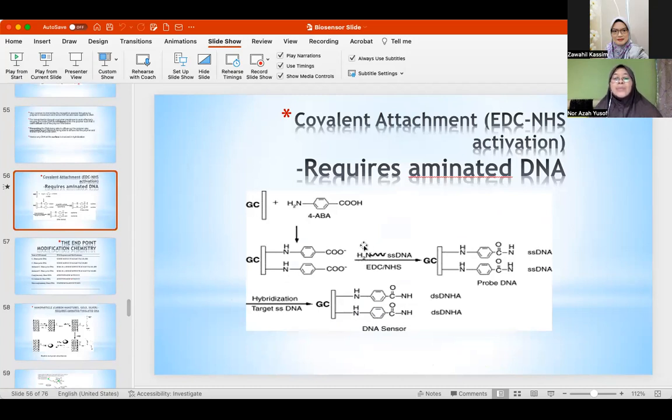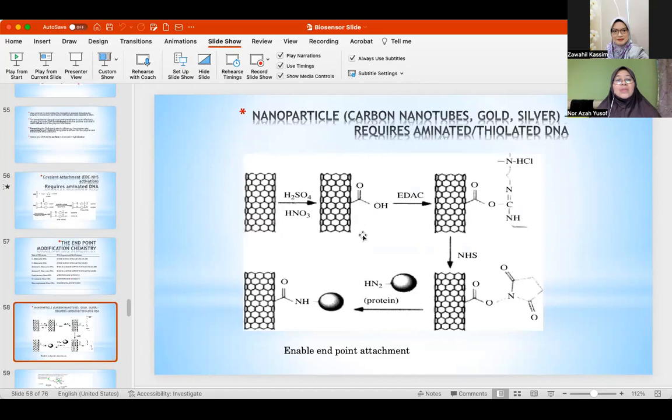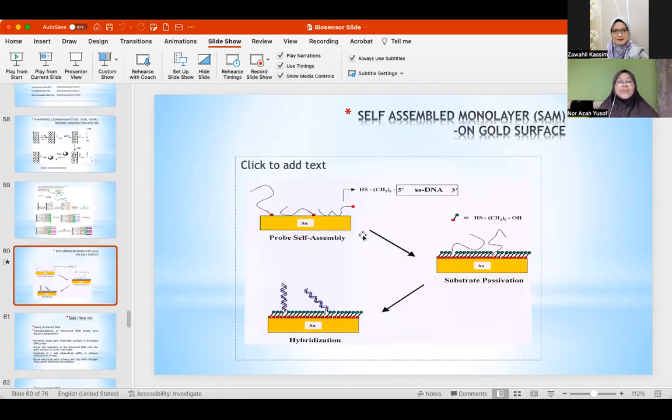So if it is antibody, we know that the antibody contains both amine and carboxyl, but we want the carboxyl to attach to the sensor surface, so we just change this sensor or the carbon surface should contain amine, so that it will react with the carboxyl group of the antibody. So it's just like you have to play the chemistry. Which one suits how to attach? If you need amine, you have to get the amine modified. If you need carboxyl, then you have to choose a proper compound that produces the carboxyl functional group on the surface of the sensor. So you have to play with the chemistry.